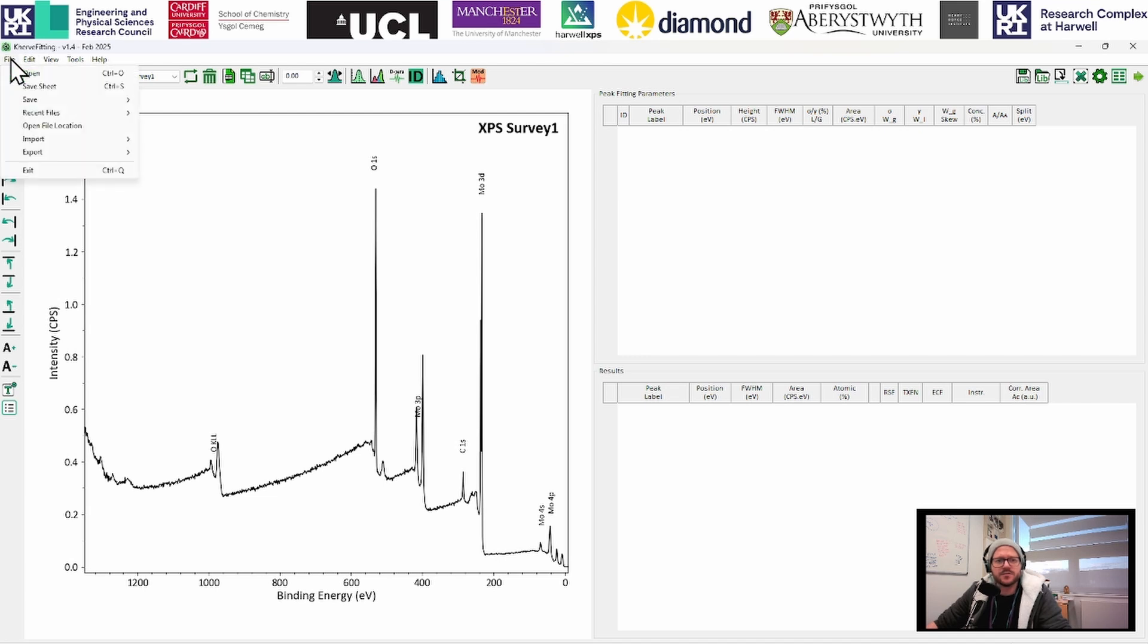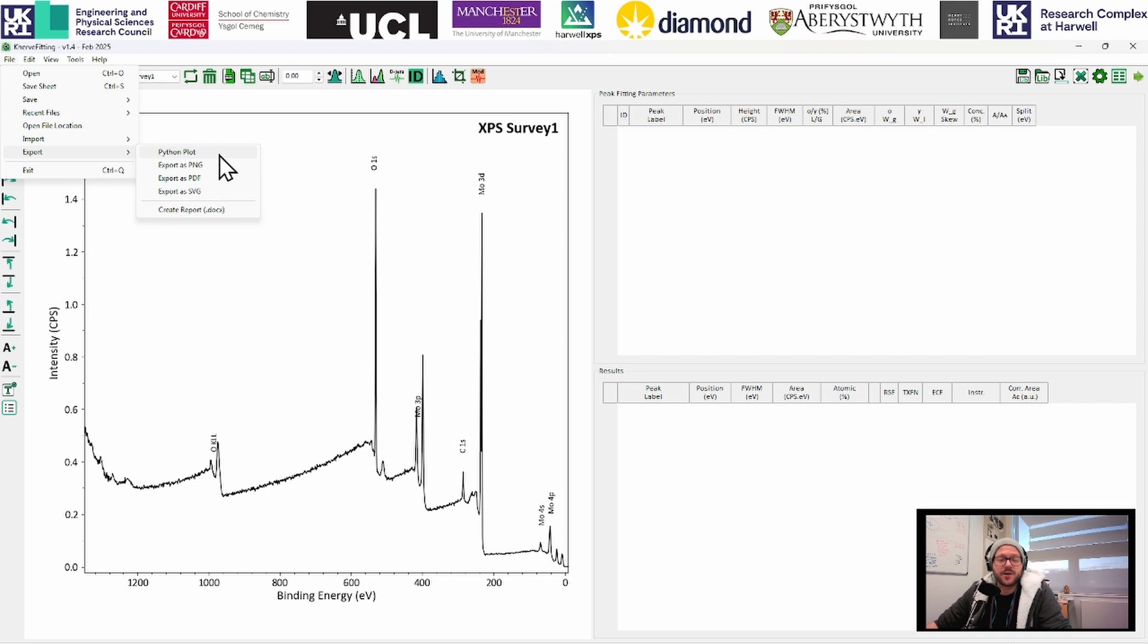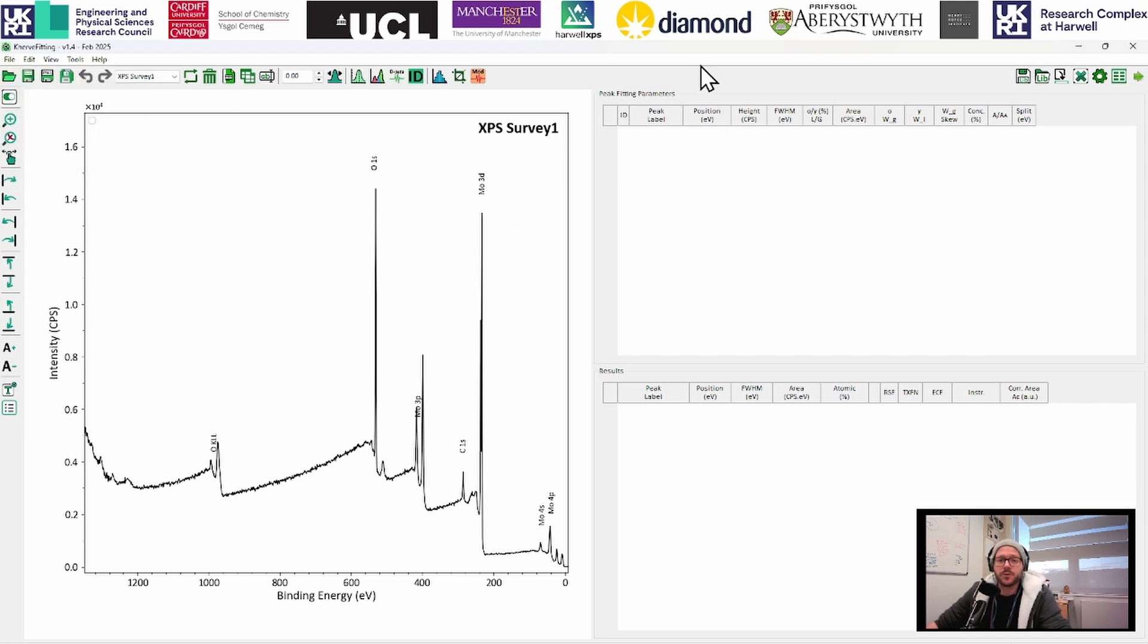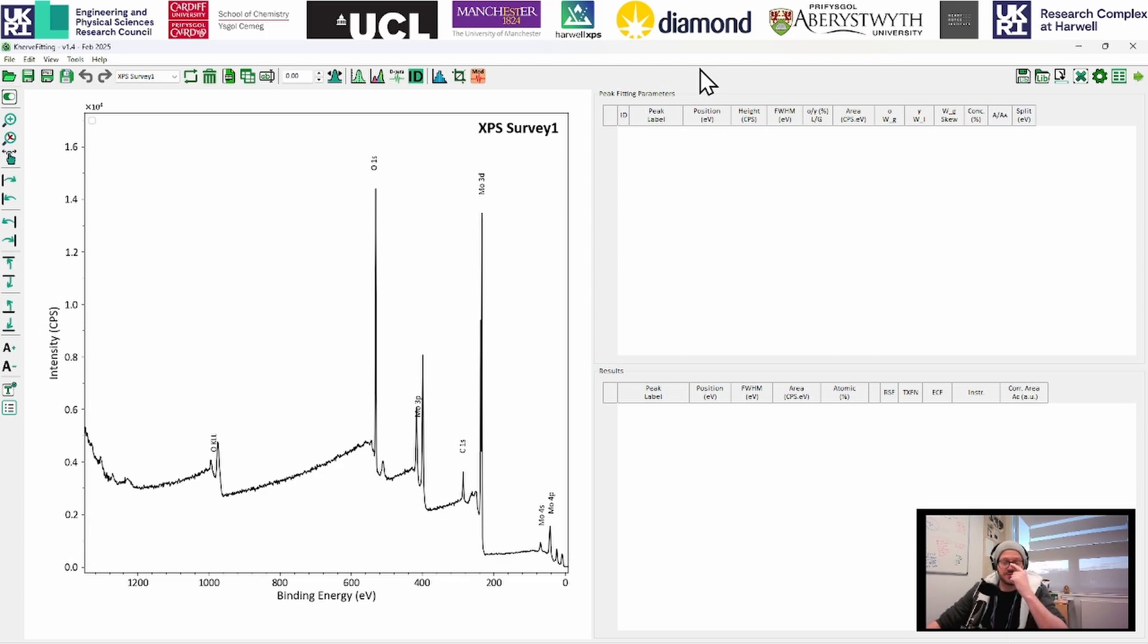And what we've got now is a nice XPS survey, which has got the major peaks labeled. You can export this. If you go to file export, you can export as a Python plot. So you can make this look however you like, or just export as a PNG. So you can put this in your reports and your presentations and your publications with all of the peaks identified that you want to show that are in your sample.